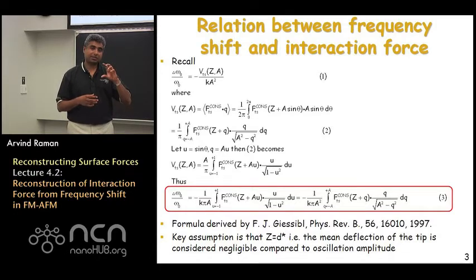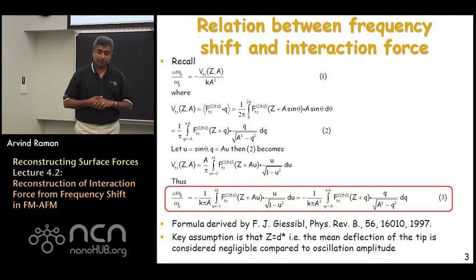You can express it either as an integral from -1 to +1, which refer to effectively the extremes of oscillation of the tip, or you can write it as an integral from -A to +A if you want to do the integral with respect to q, which is the actual tip displacement.